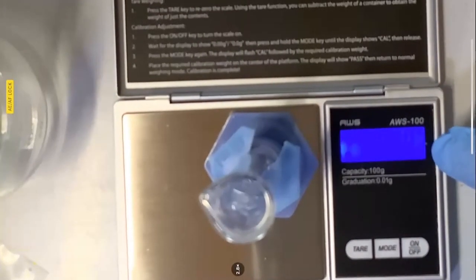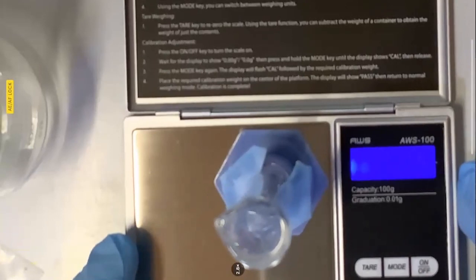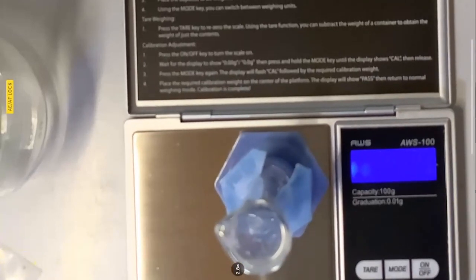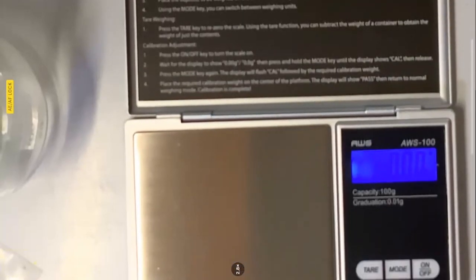But it is recording something like 24.74. That's what it's fluctuating. I don't think the camera can pick up that mass for some reason because it can't contrast it. Anyway, I write the second mass with the liquid. Then I'm going to read the volume.